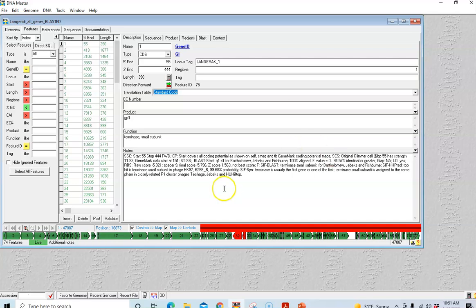So the way I write my note then is that I say blast start Q1S1. So you write Q1 colon S1 for Bartholomew, Jebex, and Fishburne. They're 100% aligned for all. The E value is 0.